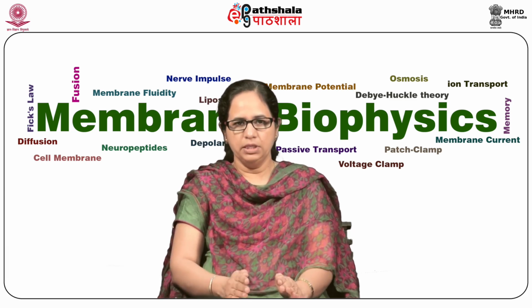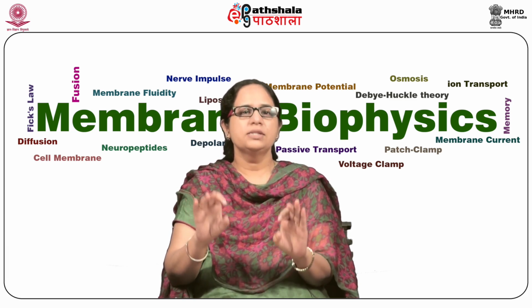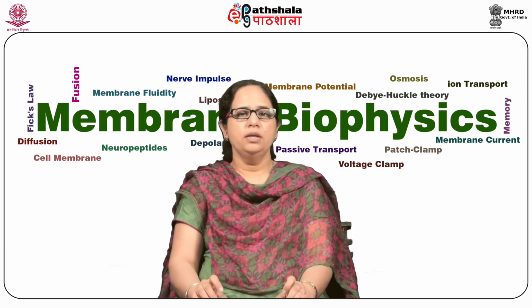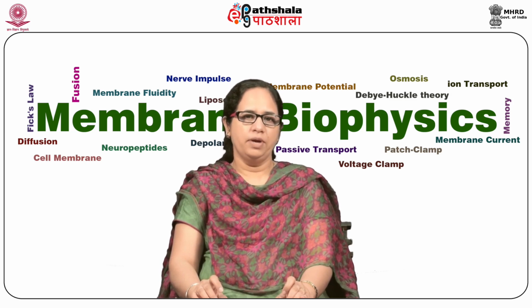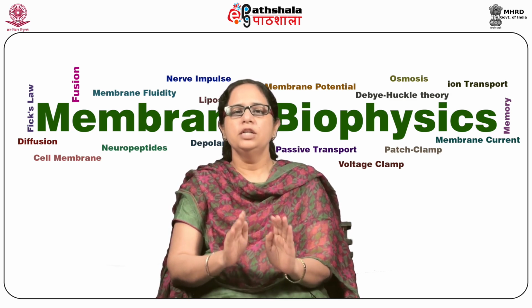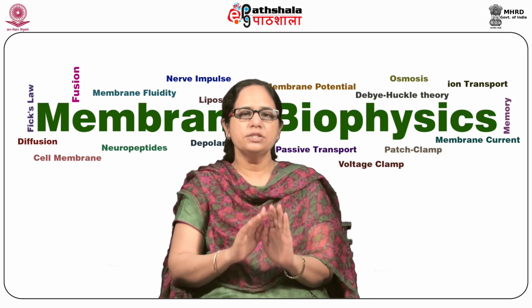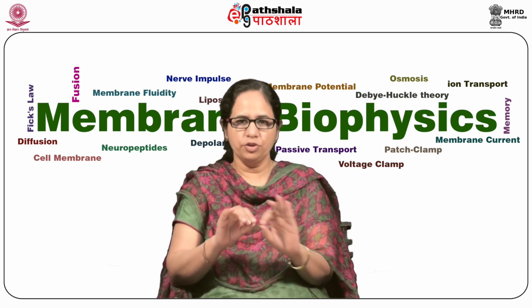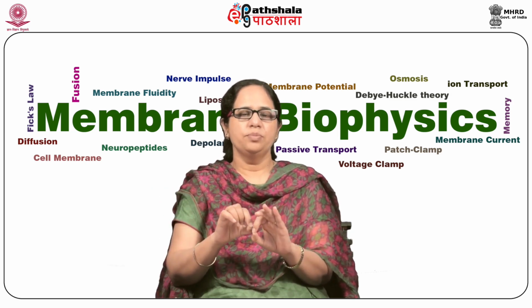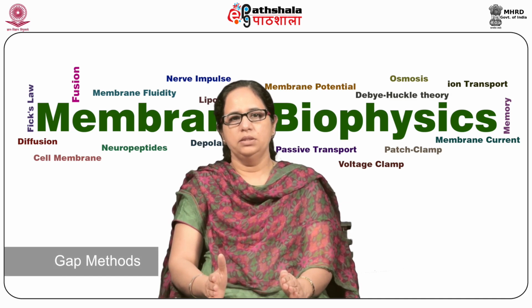Axial wire technique is applicable to long cylindrical cells such as giant axons of squid and barnacle giant muscle fibers. This method is limited to the cells of diameters large enough to permit penetration of axial wire without damaging the membrane properties.